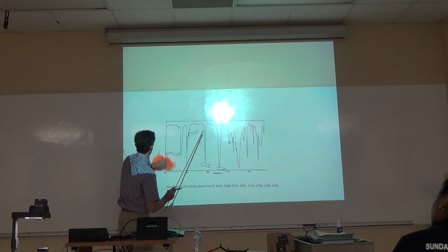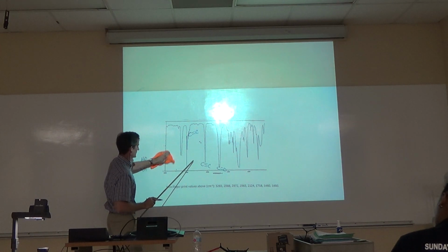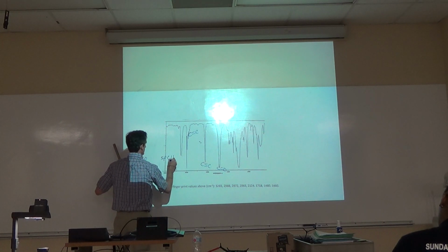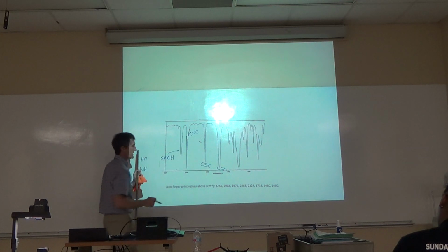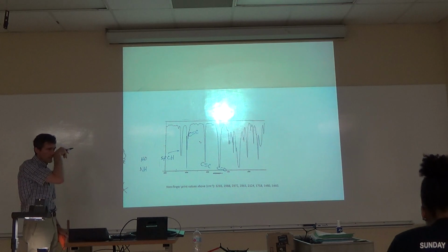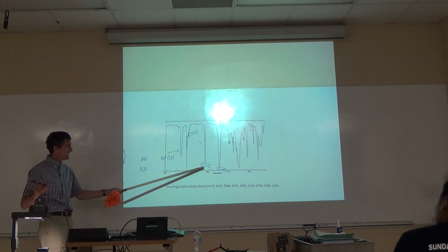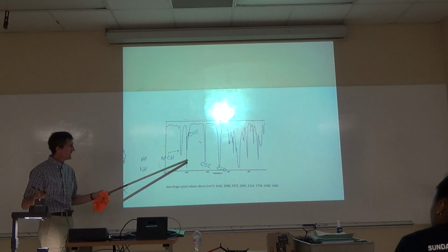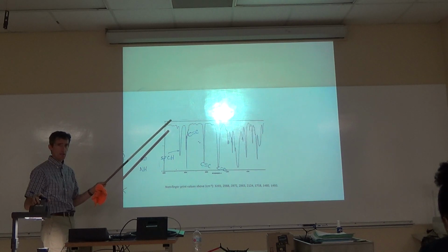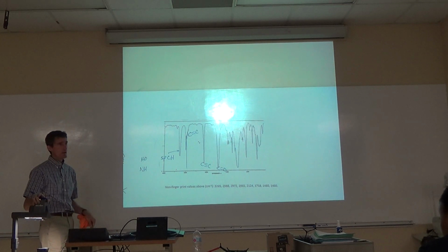By the way, what would this be? Let's peek over here. If you got an alkyne, the terminal CH would be an SPCH. That could be that right there. SPCH tends to be about 3300, tends to be pretty strong. That peak can often be forgotten about, but if you have an alkyne, one of the carbons has an H on it. Now, hopefully there is a terminal alkyne up there with a carbonyl. Because if there isn't, we're going to have to re-evaluate our peak assignments here. All right.